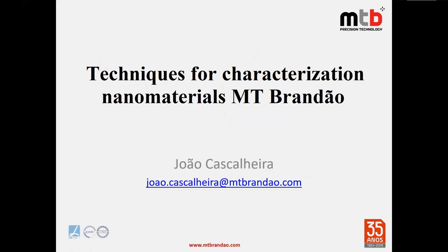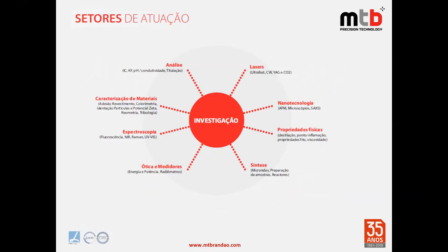We have available for nanomaterial characterization a big amount of techniques covering laser nanotechnology, physical properties, synthesis, optics, spectroscopic, material characterization, and analysis.